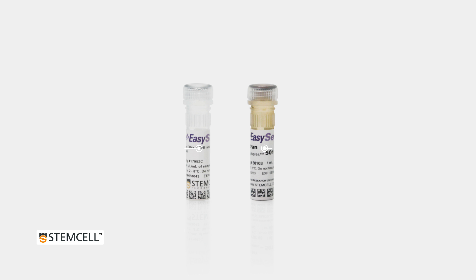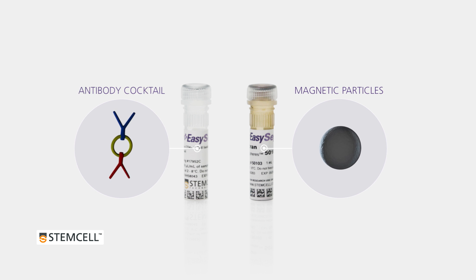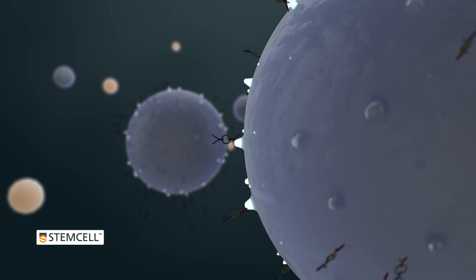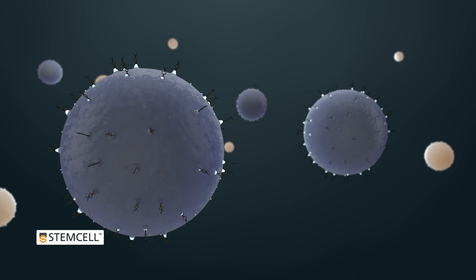EZSEP kits contain two main components: antibody cocktail and magnetic particles. The antibody cocktail contains antibody complexes that bind to targeted surface antigens on your desired or undesired cells, depending on whether you are performing a positive or negative selection.